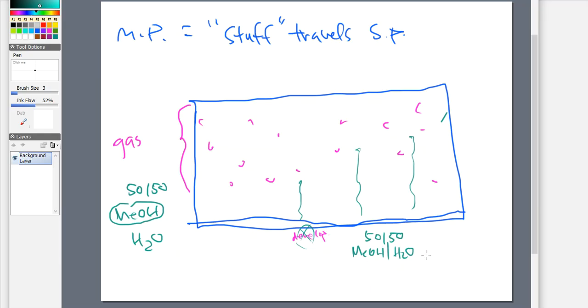And that means that the concentration of water is going to be larger by the time my plate gets in there. And the concentration of my methanol is going to go down because it's evaporating and it's escaping. So by the time my plate goes in, there is a chance that it's no longer 50-50, but there's a chance that it might be 70-30 now. That's the mobile phase. That is what that plate is going to see once it gets dunked inside of the tank, inside of that mobile phase. And once that mobile phase starts getting into the stationary phase and soaking up through the plate, that composition could be changed.